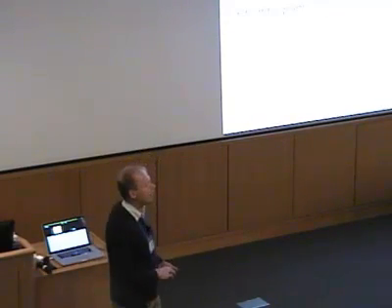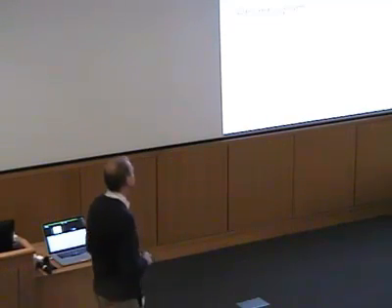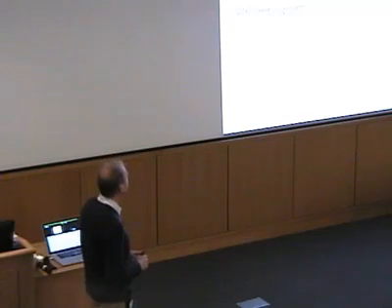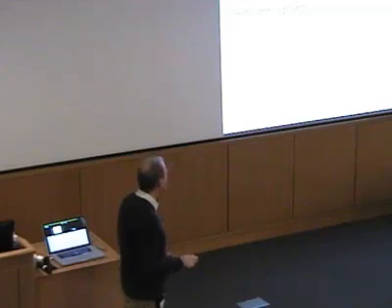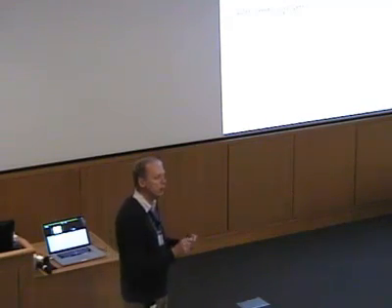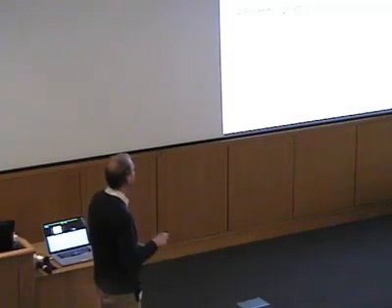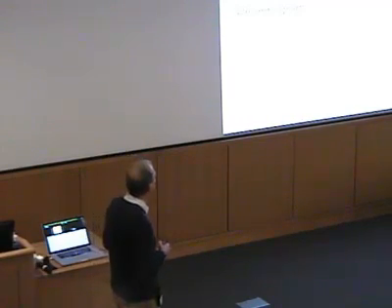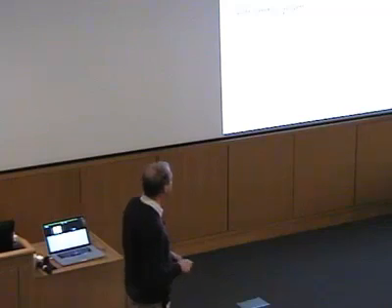So the way that we can analyze spectra like this is to use what are known as rhombograms. Right? It turns out that the positions of the features there depend not on the values of D and E themselves directly, but only on the ratio of E over D, this rhombicity parameter. And so it's possible, if we assume that the zero field splitting is very large compared to the interaction with the field, to calculate where all the possible lines in the spectrum would be for any value of E over D. Right?